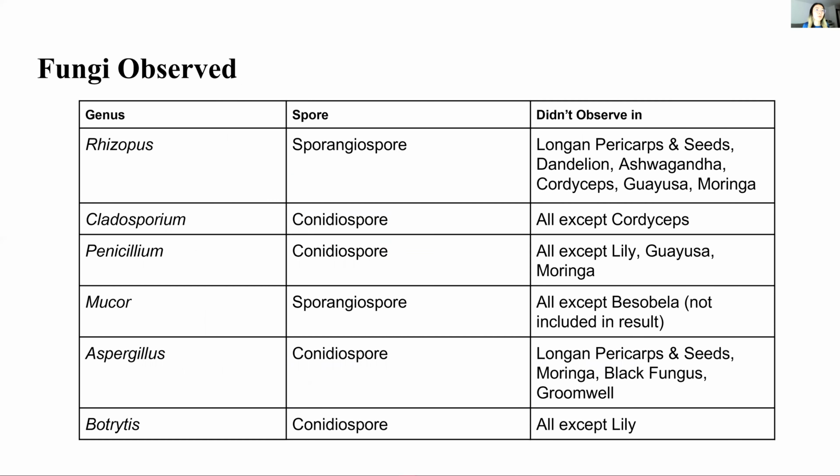After assessing the mold spore arrangements for each moldy strawberry under the microscope, I found that Aspergillus and Rhizopus are among the most common genera of fungi that infected the treated strawberries. And the treatment that did not show a certain genus of fungus could potentially signify a species-specific fungal inhibitory action.